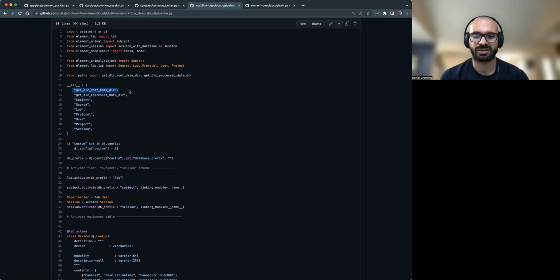And so on that same thinking, if we were to want to reference these tables in a different instance of a Jupyter kernel, where we didn't have these activated, but we still needed them in a specific table.